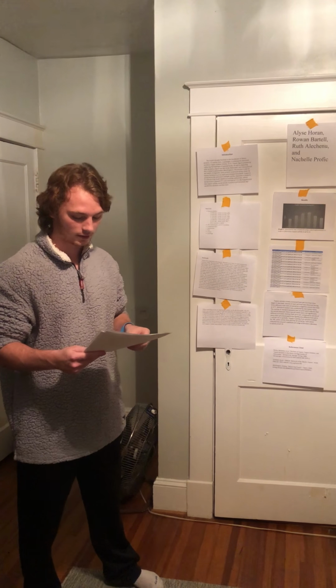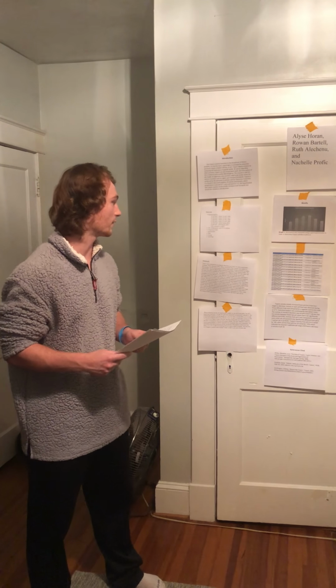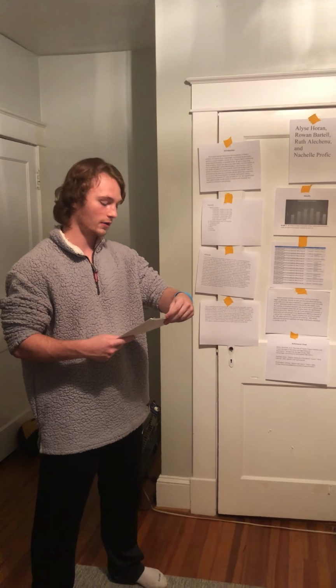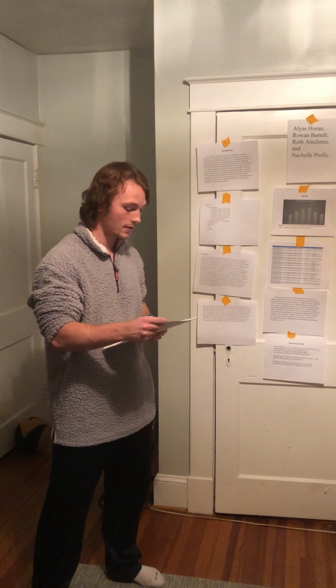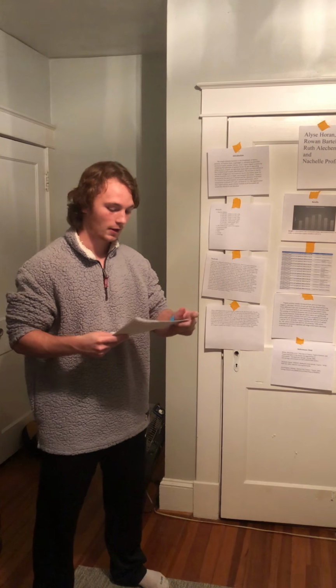When comparing our data with another group who tested the optimal value of pH, their results were proportional to ours, showing an increase of trypsin activity from pHs 5 to 9 and a decrease after 9. Their results show an optimal value of 9 with an absorbance of 0.479, which is very close to our 0.48 absorbance. This pH value concludes that bacteria will grow most efficiently and fastest at a pH of 9.